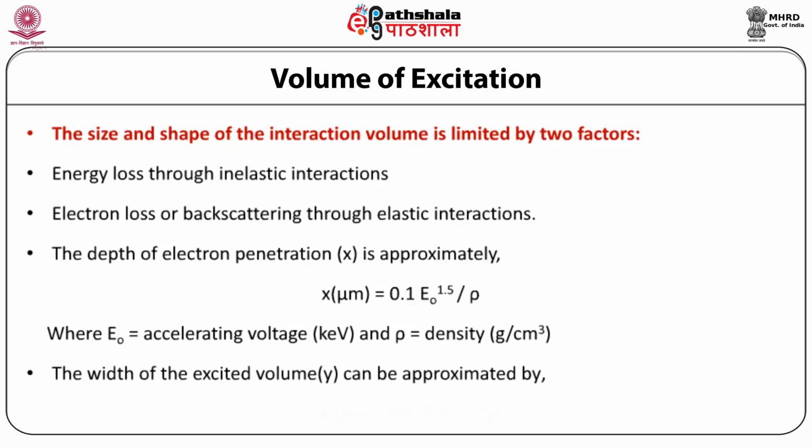The width of the excited volume, which is Y, can be approximated as Y = 0.077 E0^1.5 divided by rho.